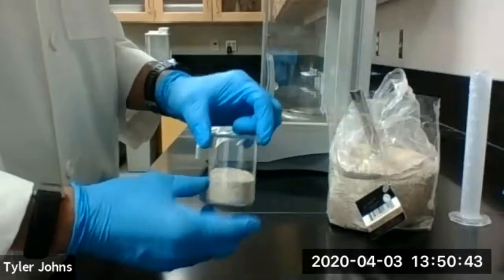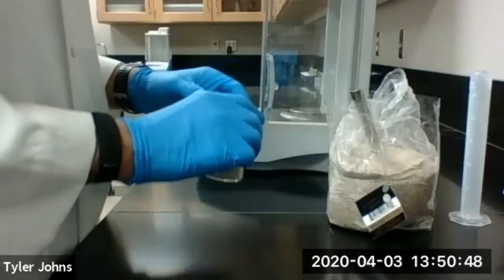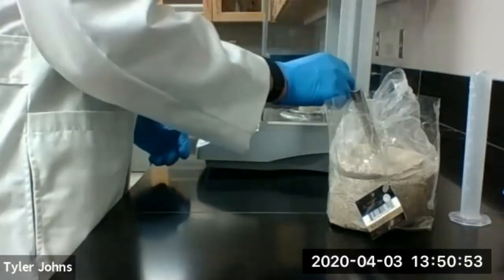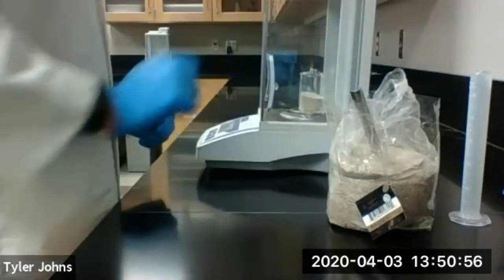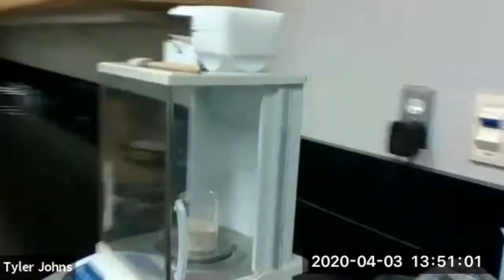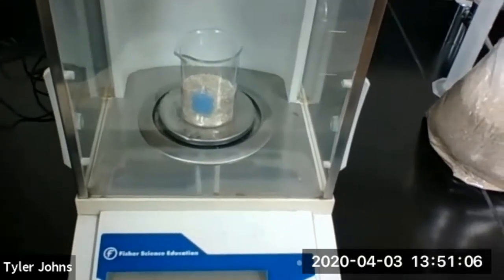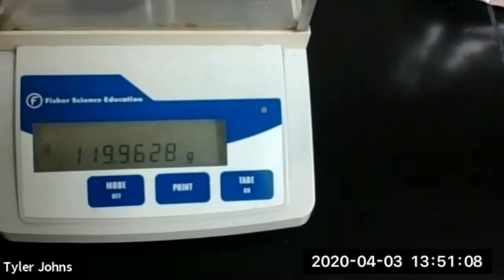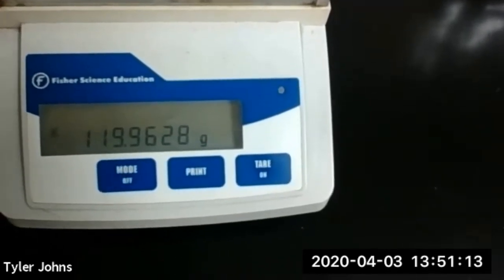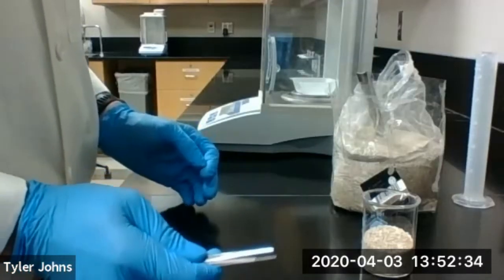We are then going to determine the mass of the beaker plus the sand. So the mass of our 100 ml beaker plus the 50 milliliters of sand is 119.9628 grams. So next, we're going to determine the mass of 20 grains of sand.